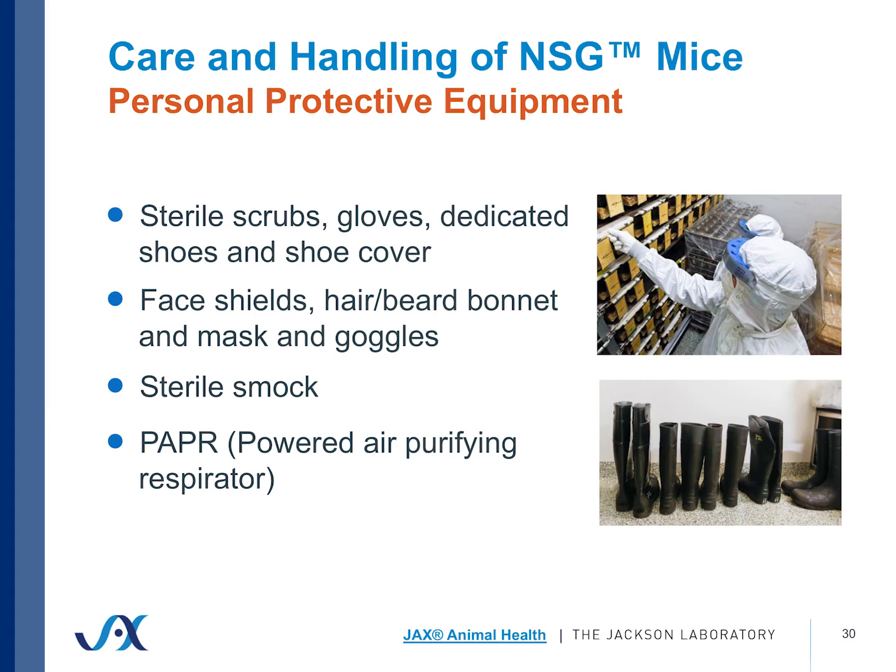Or, and if you're able to do it, we do the air respirators, the PAPRs, powered air purifying respirators. Anything you can do to minimize the amount of, again, particulate or airborne matter that might be shared from mouse to mouse, from cage to cage, or anything that comes from you that can come in contact with the mouse, because you don't want to introduce any microorganisms from the commensals on your own skin into these mice.